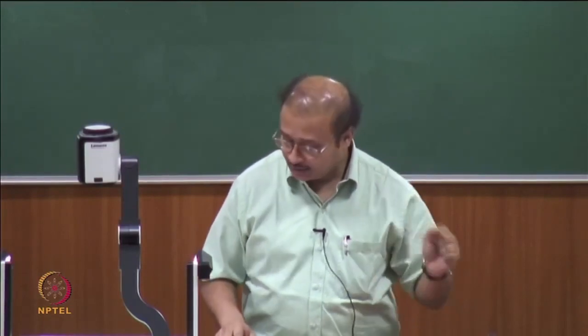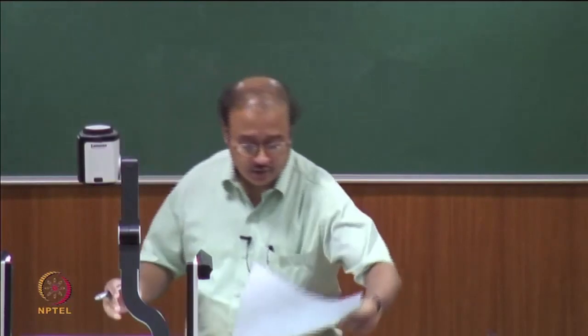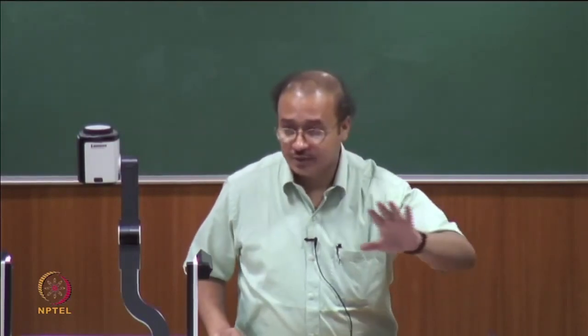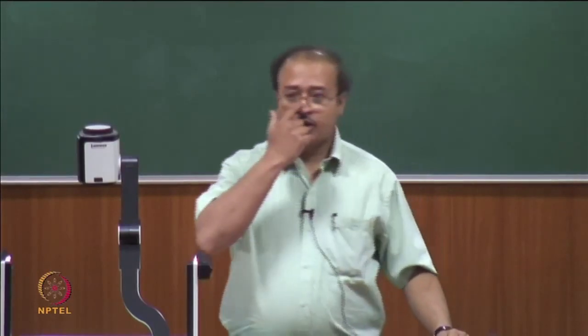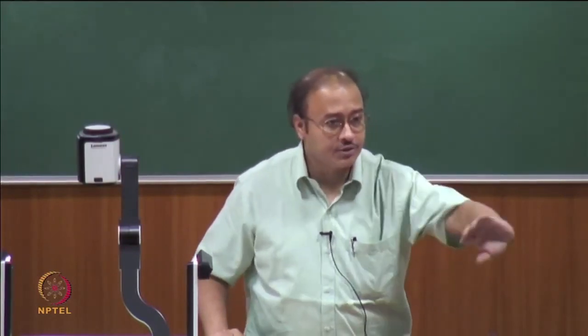Now, listen, there is one more thing possibly you would realize. When you are doing any experiment, say a fluorescence experiment, because here we are discussing fluorescence, no matter what you do, depending upon the solvent, you always have some dissolved oxygen in it. Now, oxygen is a quencher of your fluorescence. It is also a quencher of your phosphorescence, but since we are discussing fluorescence, let us stick to that.